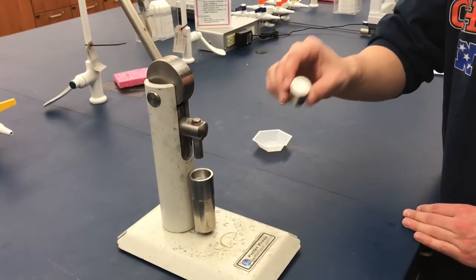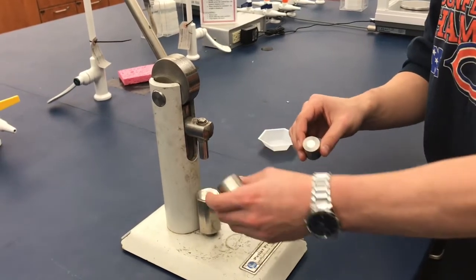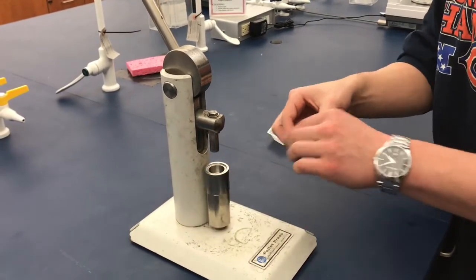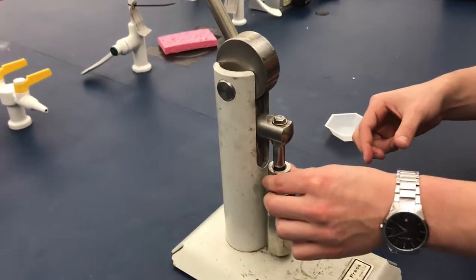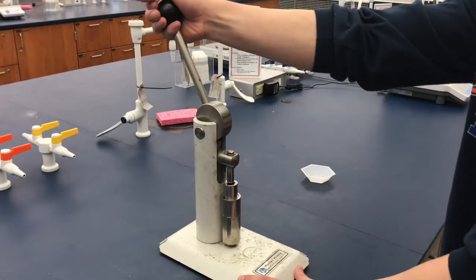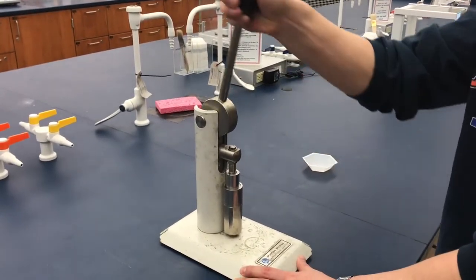If your pellet is stuck, flip tube number one around so that the flat edge is now on the bottom of the pellet press. Push down on the lever again to push the pellet out of the tube.